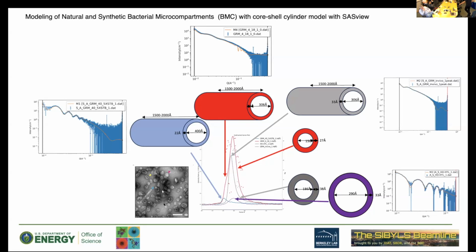Good question. On the company manuals or company test cases, we can go from sizes of 100 nanometers, 1,000 angstroms, and even more, down to sizes about 5 kilodaltons. I mean, you don't want to do the small one. No. But it is good for lipids. So that's lipid protein assembly or lipid LNPs. And I think even for those copolymer RNA it will be really good.